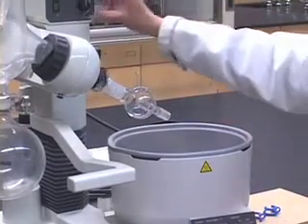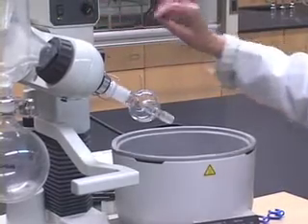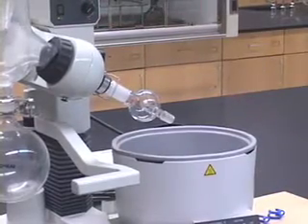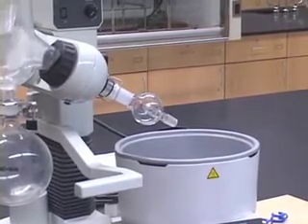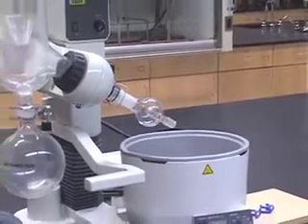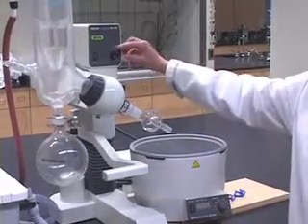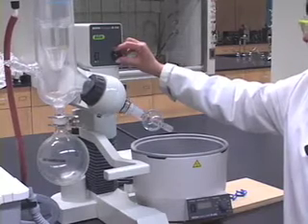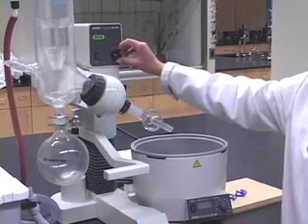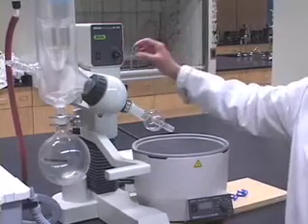Why do we need a rotation method here? Remember, any time you boil off a solvent, you either use boiling stones or boiling sticks to ensure that it does not bump. The same purpose is served by rotating the container in which you have your solution. So, there will not be huge bubbles formed inside the flask.